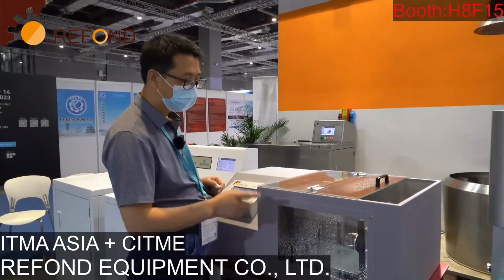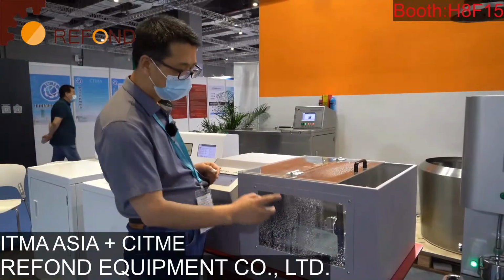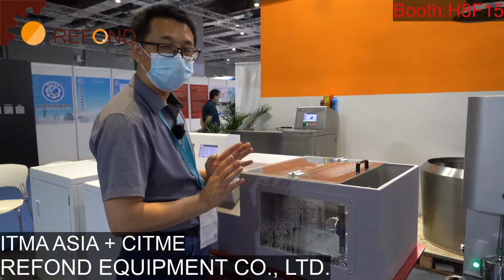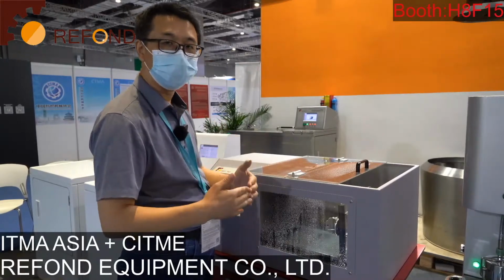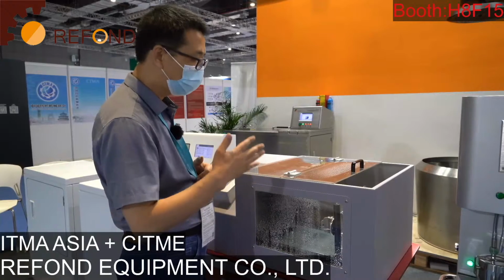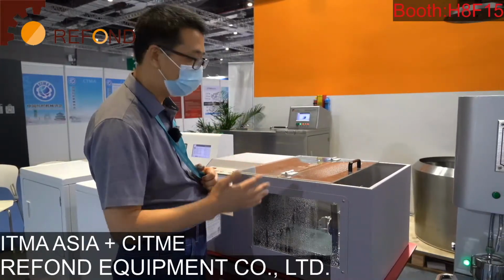The function of the rain tester is to simulate the rain which impacts on the fabric and to assess how much water penetrates from the fabric into the backside.